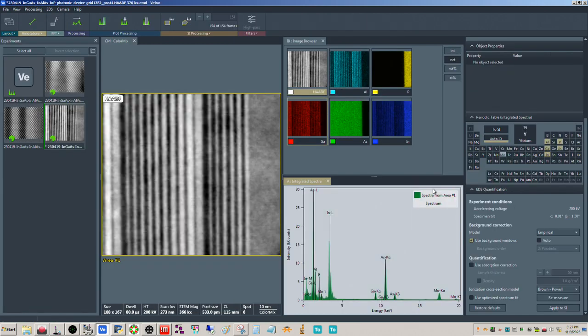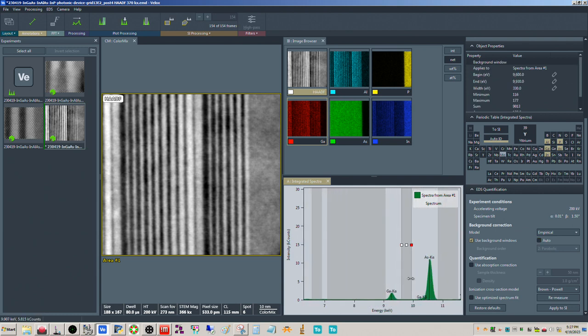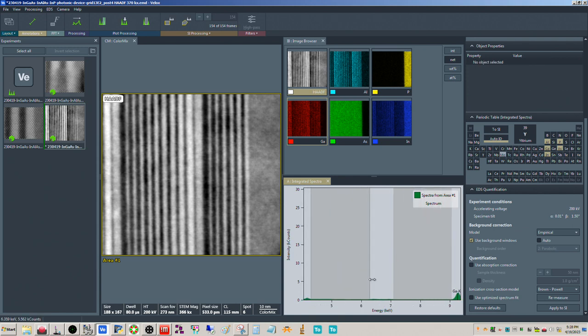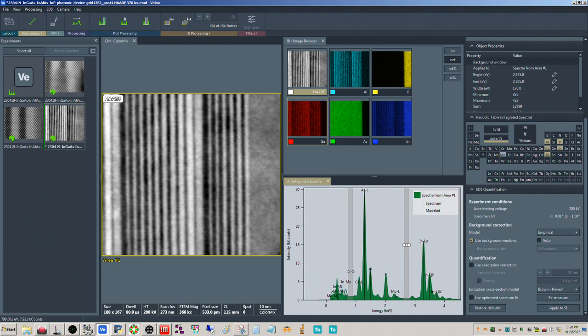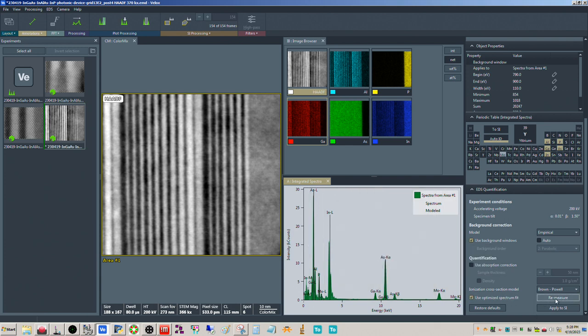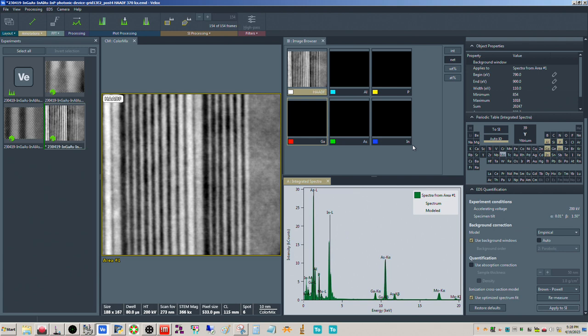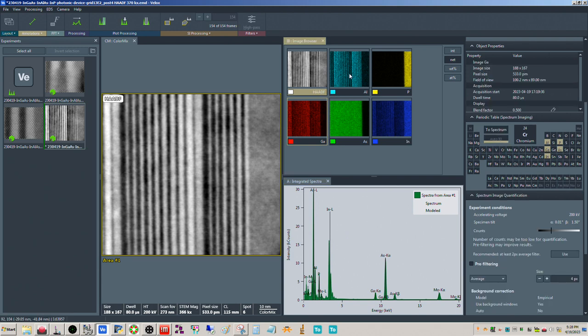Okay, so just like we did before, empirical auto use windows, and we can check and see what we got here. That one's kind of spurious. Modeled. Okay, otherwise it looks good. Show windows, use optimize fit, remeasure, and then apply to SI. Once you fudge with the background windows, this auto isn't checked anymore. That's normal. Okay, and so this is without any pre-filtering.